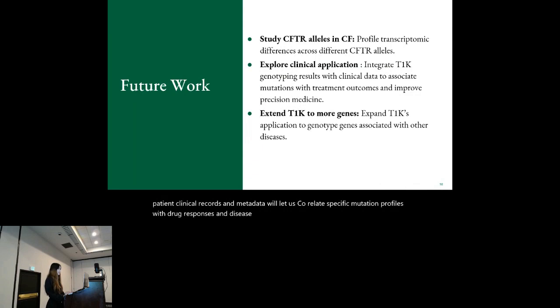This integration lays the groundwork for truly personalized precision medicine strategies in cystic fibrosis care. We also plan to extend T1K beyond CFTR to other polymorphic genes, building custom allele references for genes like BRCA1 and CYP2D6, which is a pharmacogene.